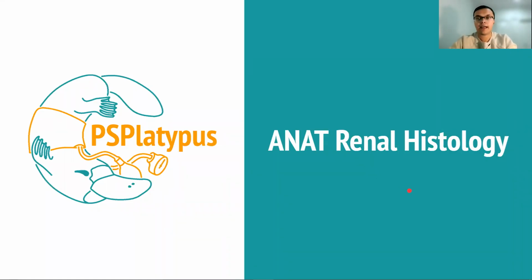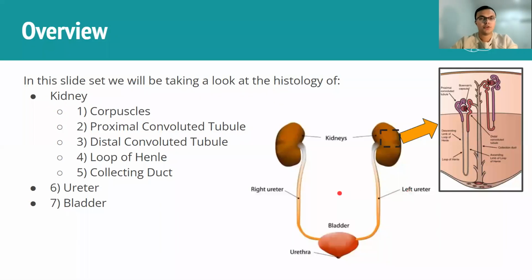Today we're going to be having a look at the histology of the renal system. So without further ado, let's get started.